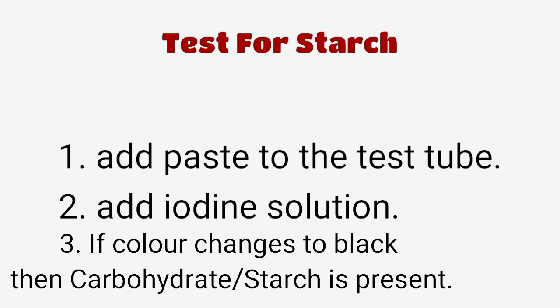Then the test for starch. You can take a screenshot here and test it on your own. You just have to add iodine solution and observe the color change. If the color changes, then starch, or you can say carbs, is present. Carb is another name for carbohydrate. So if you hear that there are carbs, they are talking about carbohydrates.